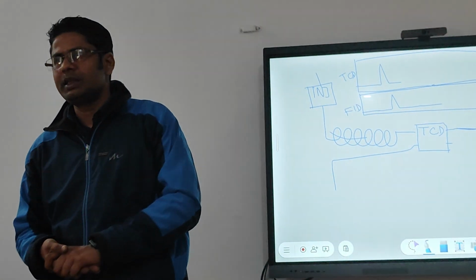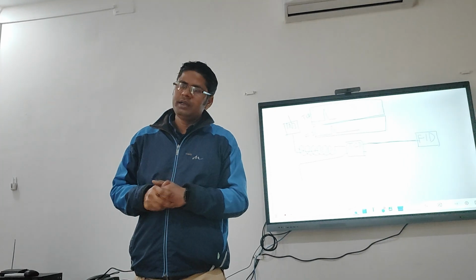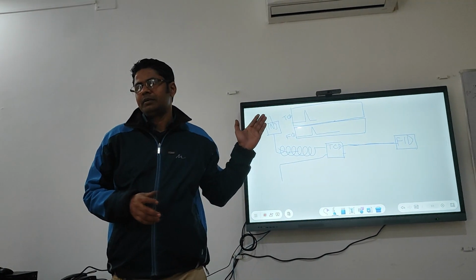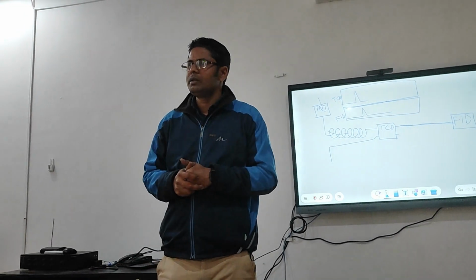When a complex mixture cannot be analyzed in a single column and a single detector, then the GC will be configured this way. This is called a special analyzer. If there is any sample and you don't know the compound, whether it is hydrocarbon or something else, then preferably you follow these two, TCD and FID, in the first process. First of all, don't inject any unknown content into this.